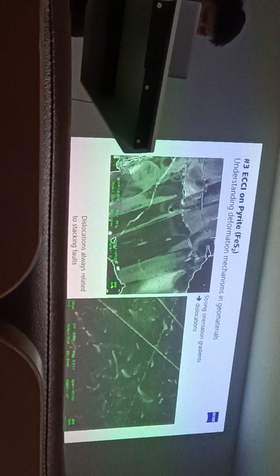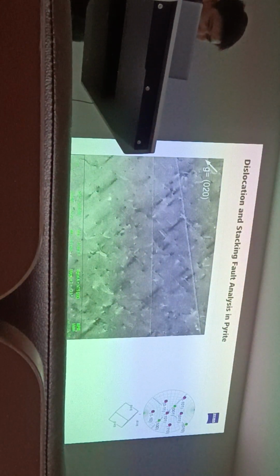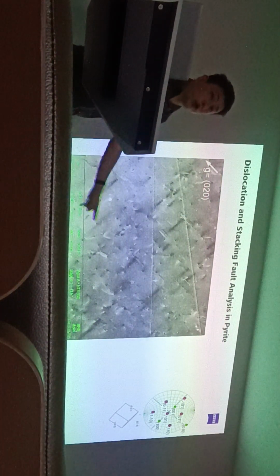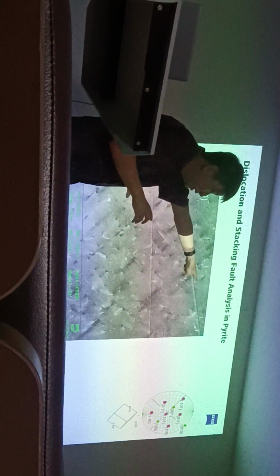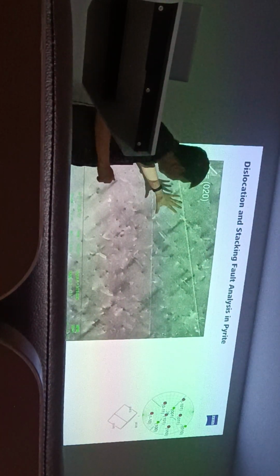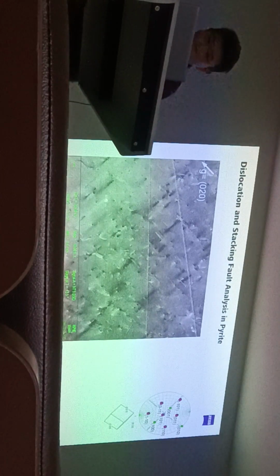Pyrite, again just another example. I will show you one on the trace analysis. So let's suppose we have all these dislocations, right? And there's a stereographic projection. This one you can actually get from the POCA software. The software will generate it, because when you enter the Euler angle into the software, it will give you this. Okay, so you know exactly which direction you're looking at, right? Now you have the image, then you can observe some dislocations, right? Like this, yes, and you can see like this, correct? So all this we can plot.